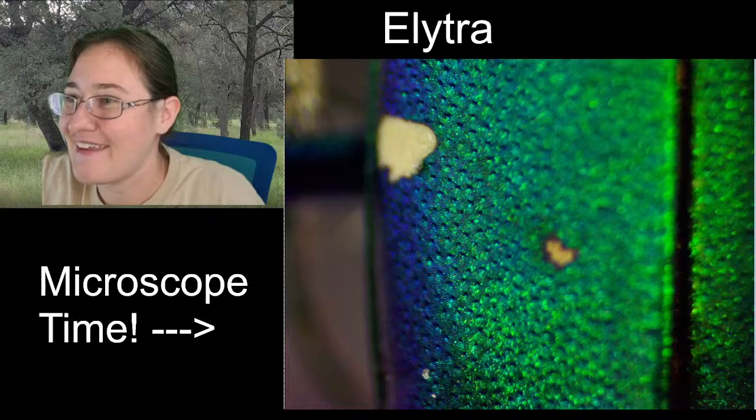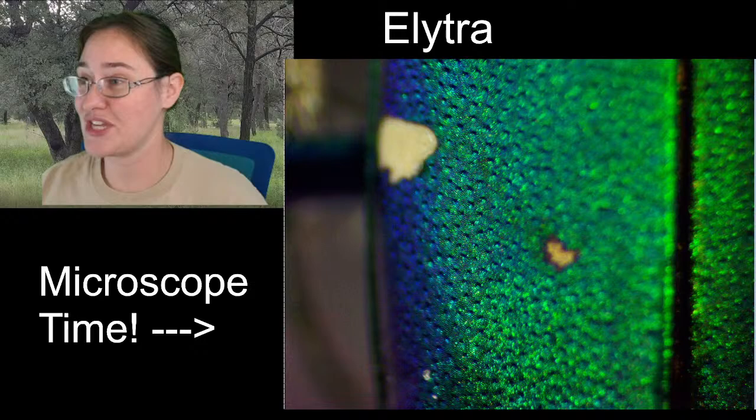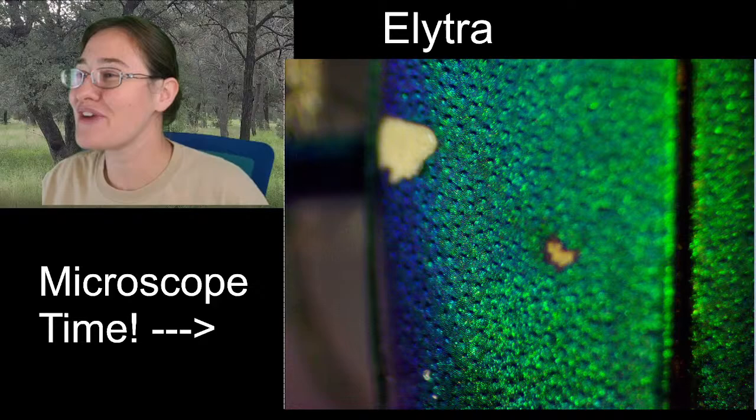These elytra will never fade. You may have guessed this, they are a structural color, not a pigmented color. So these are all little itty-bitty crystalline structures on the top of the exoskeleton. And it's the way that they reflect the light that makes them look green and blue. And yes! Susan, you are right. We are looking at punctations. That's a great word.